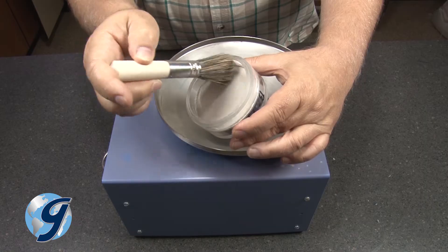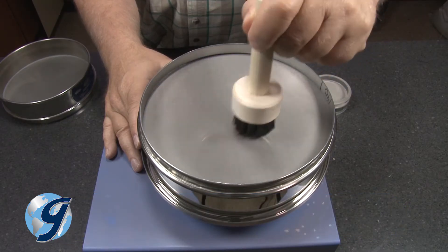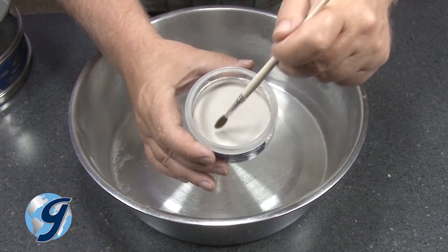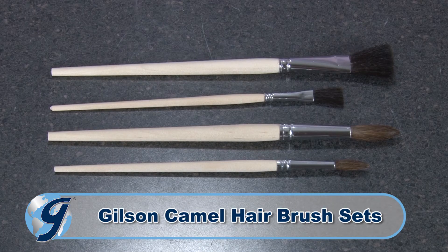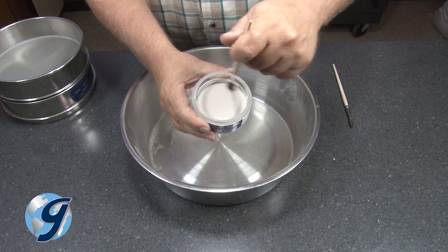Gilson's TSA-179 nylon sieve cleaning brush with thick nylon bristles is best for cleaning number 120 mesh and finer. And for cleaning delicate mesh sieves, Gilson also offers camel hair brush sets. This set of four comes with two round tip and two flat tip brushes that are set in solvent resistant cement.